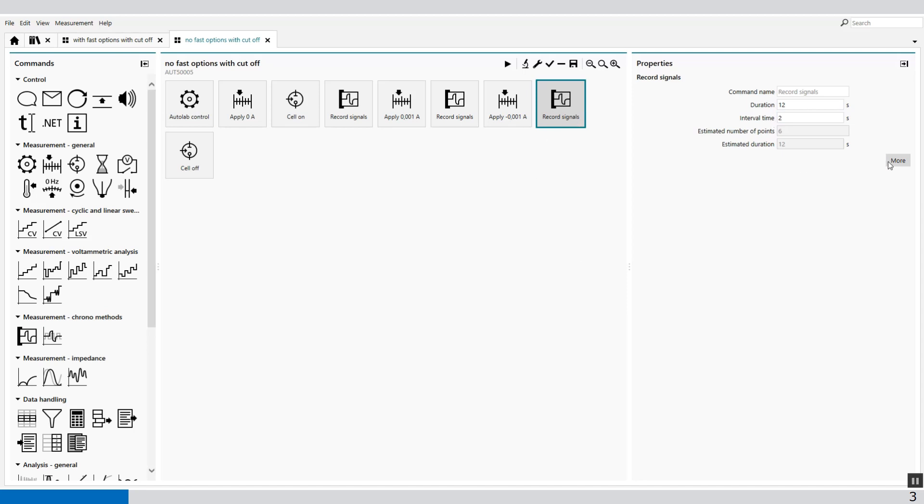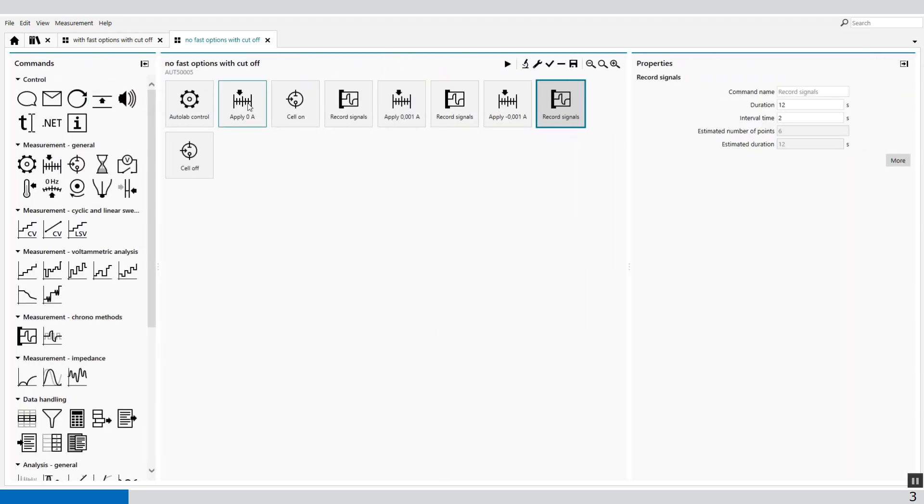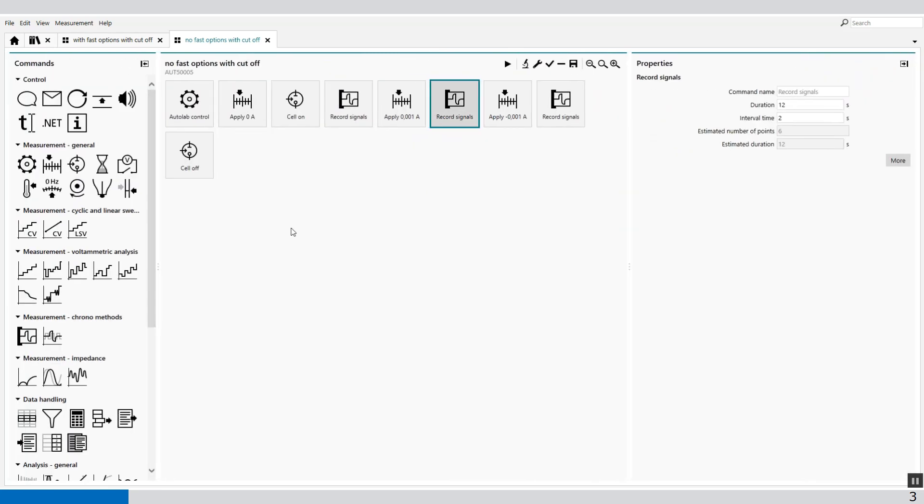I don't use the fast options. So the fast options are disabled, also for the other record signal. What I do use is the normal options.